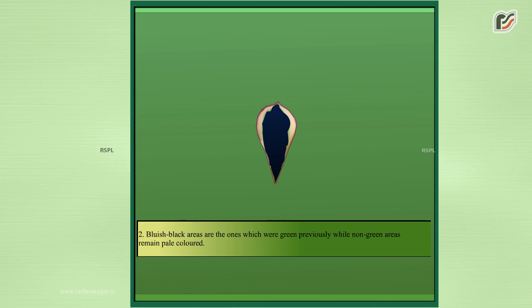Bluish black areas are the ones which are green previously while non-green areas remain pale colored.